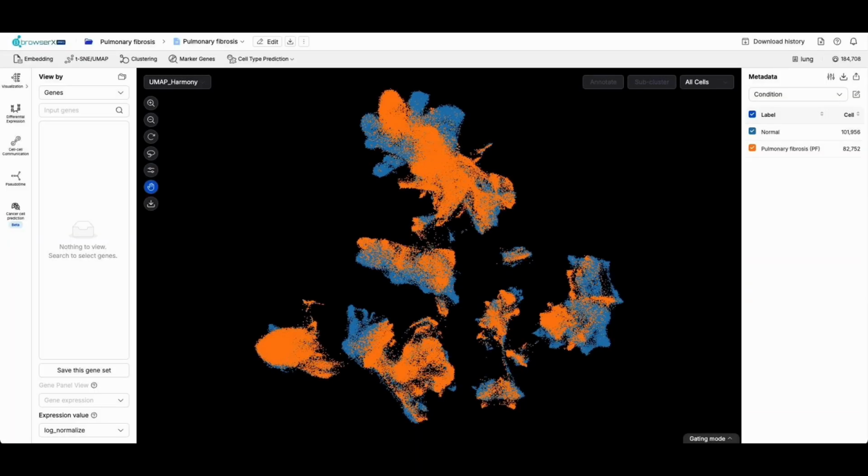Despite clustering cells together and annotating them as one cell type, one cell group still represents a heterogeneous population of cells at various stages of development, differentiation, or disease progression. Thus, it may be of interest to distinguish these various stages and identify key genes driving cellular transitions.